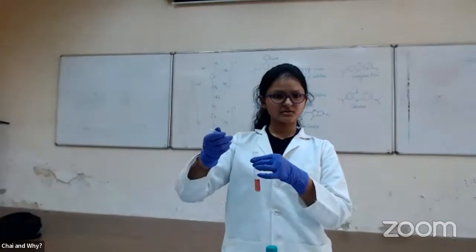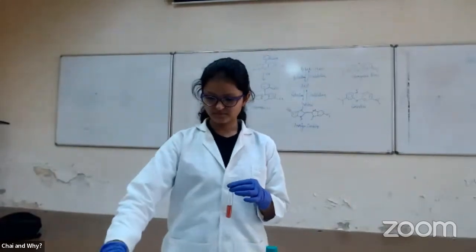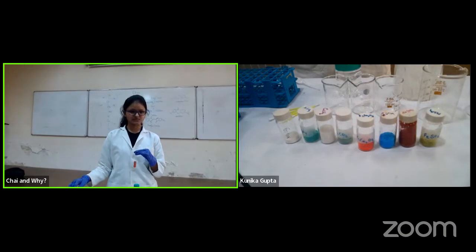I'll just turn on both cameras. Hang on. Okay, so that we can zoom in. Just give me a second. Wait, let me just see if I can adjust it so we can get this camera.